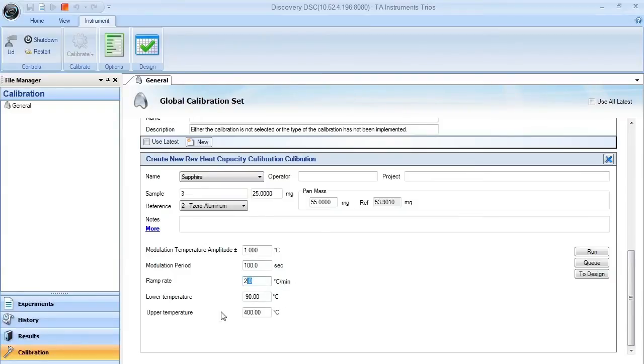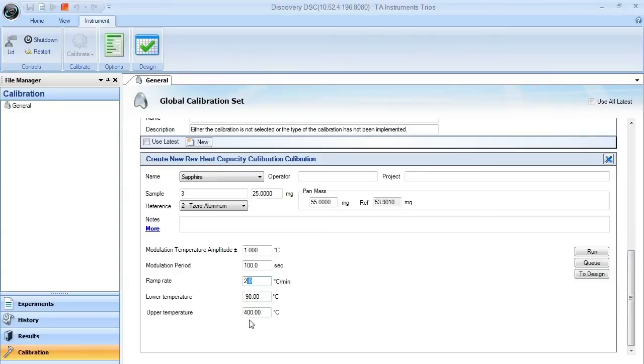You also want to make sure that your upper and lower temperature range is correct as well. You would like to bracket these temperatures around the sample experiment that you intend to run. In this case, we'll calibrate from minus 90 to 400.